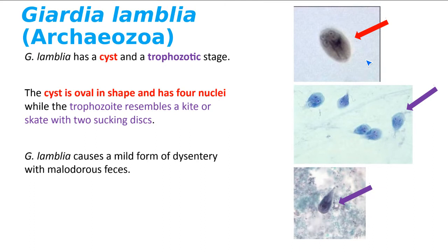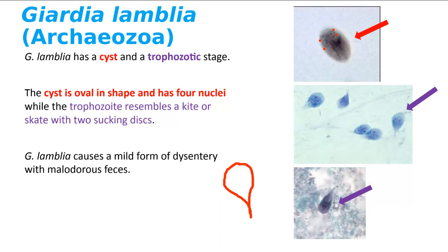The cyst is oval in shape and has four nuclei — you can count them: one, two, three, four. When this gets into the stomach, the acid weakens it; it breaks apart in the small intestines and becomes trophozoitic. Each of those four nuclei becomes a trophozoite. To me, the trophozoite looks like a kite — some people say it looks like a flounder. It has two structures that look like eyes, but those are sucking discs. It also has multiple flagella, which are not stained so you can't really see them.